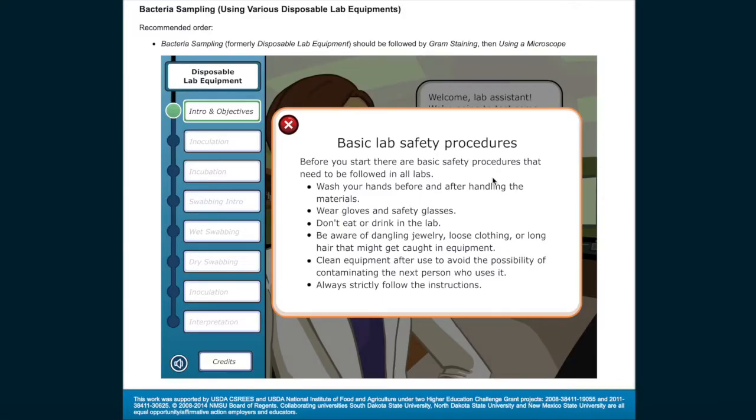Basic Lab Safety Procedures: Before you start, there are basic safety procedures that need to be followed in all labs. Wash your hands before and after handling the materials. Wear gloves and safety glasses. Don't eat or drink in the lab. Be aware of dangling jewelry, loose clothing, or long hair that might get caught in equipment. Clean equipment after use to avoid contaminating the next person who uses it. Always strictly follow the instructions.